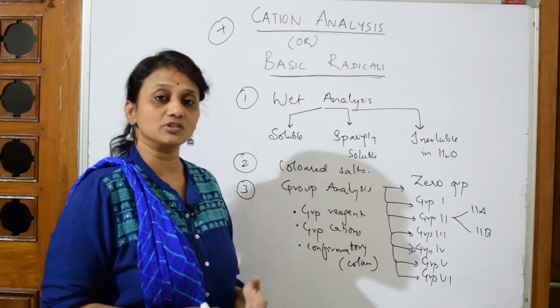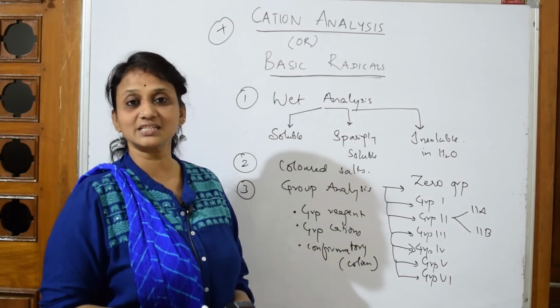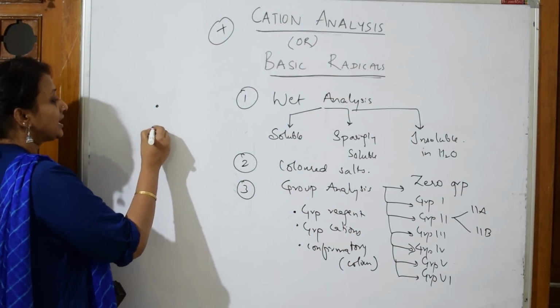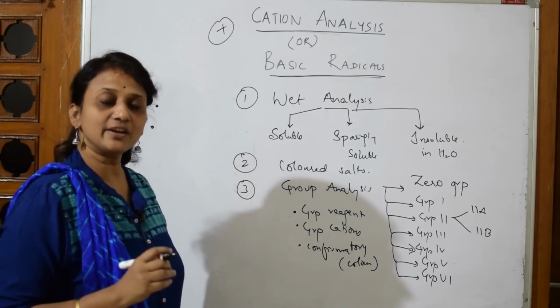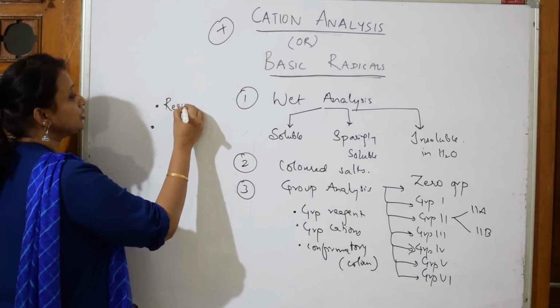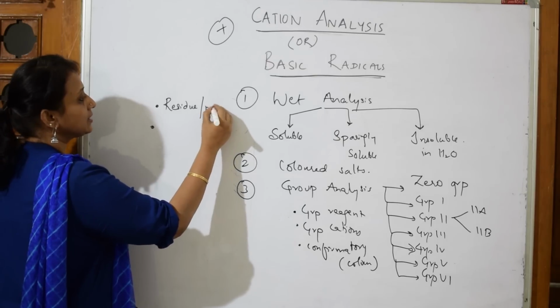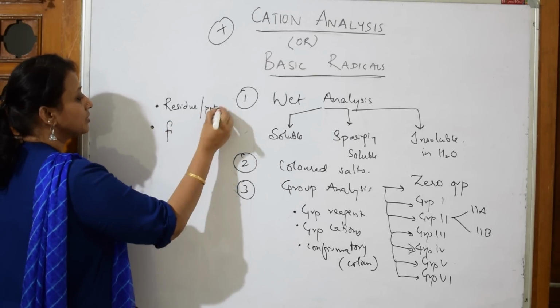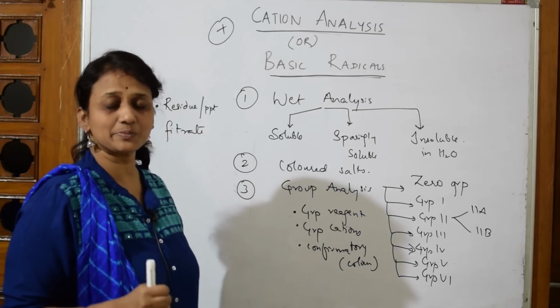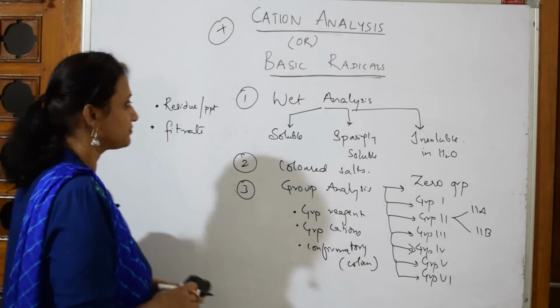Before I go to the main concept, one important thing: most of the students get confused between two different terms in cation analysis. They don't know the concept of residue or precipitate and the meaning of filtrate. They come and ask, ma'am, what is filtrate, what is precipitate? Students, there is nothing to get confused about.